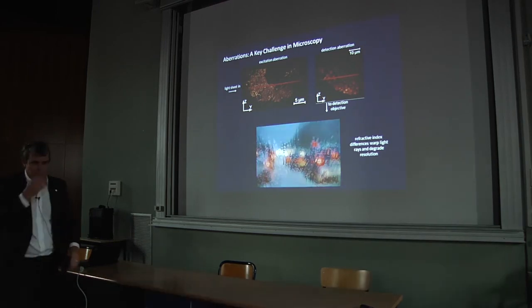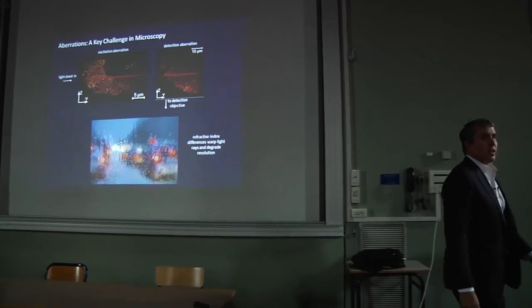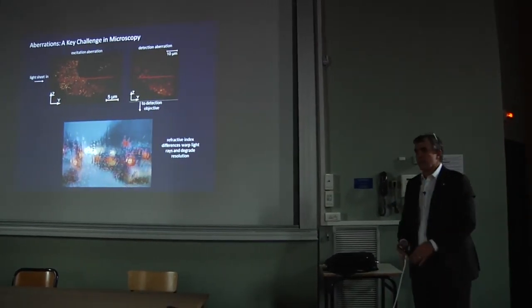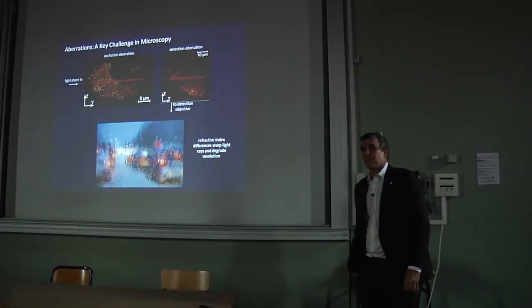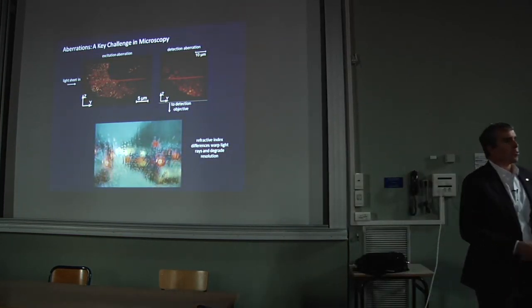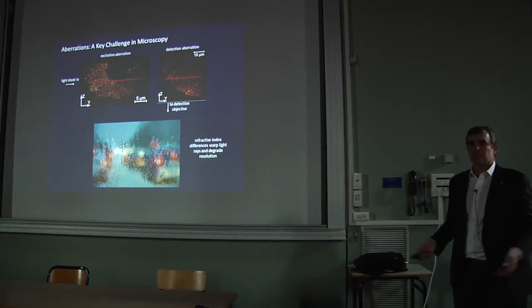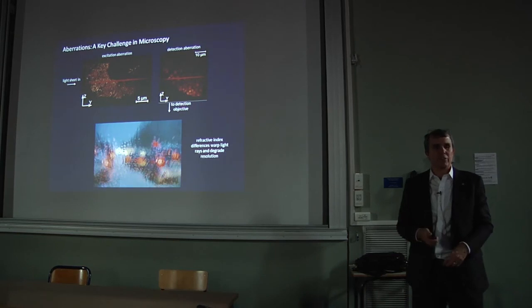So the final topic. The problem going forward is that too much of our understanding of cell biology comes from looking at cells on coverslips. But they certainly didn't evolve there. So we need the ability to look at them in the whole organism, where there's all sorts of cell-cell signaling and other stuff going on.